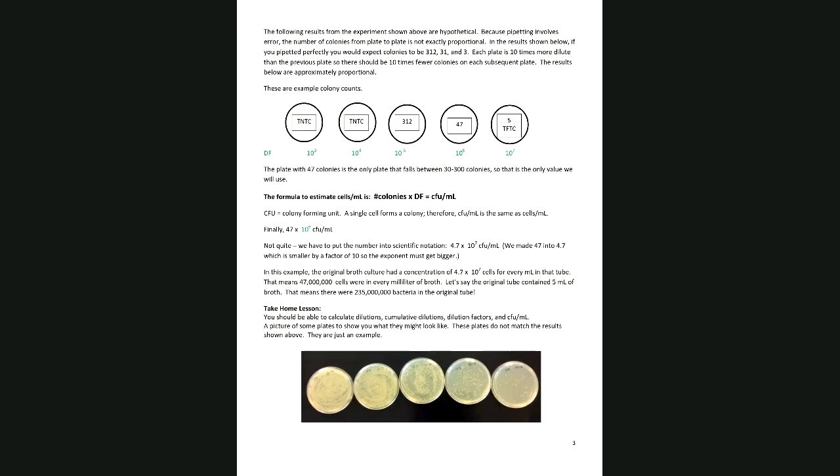The 10 to the 5 plate has 10 times more than the 10 to the 6. So what would your estimate be? Right, so around 470, 500 would be your estimate, right? 10 times more.